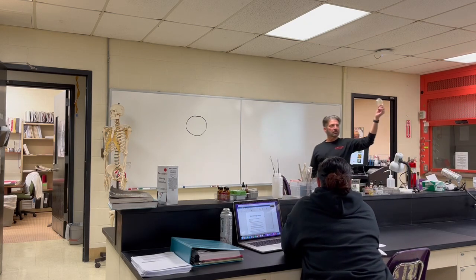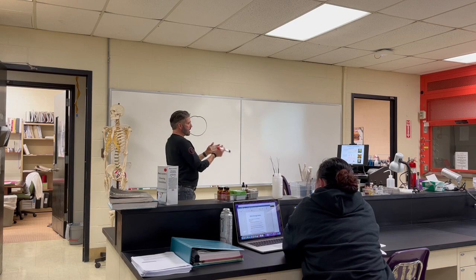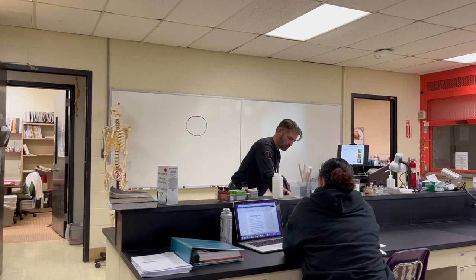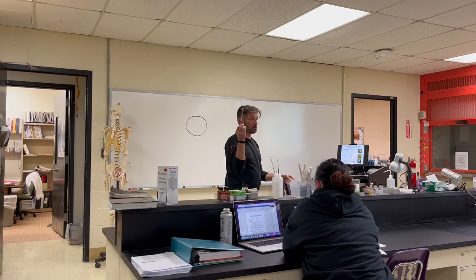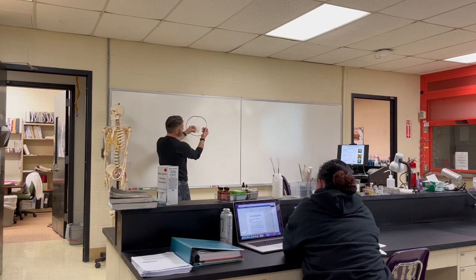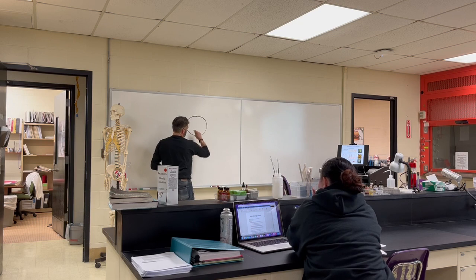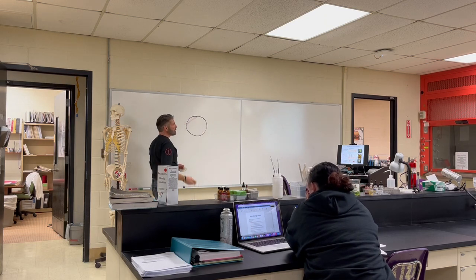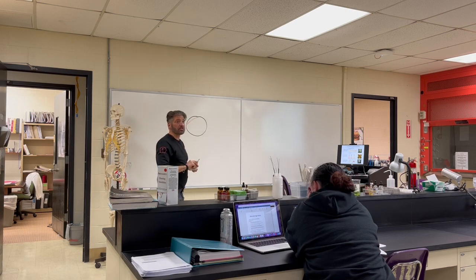So in theory, here's the plate. I'm going to take the cover off. It's sterile. Well, now it's not. But I'm going to take something out here and swab it. Let's just say I swab it like this. So I just swabbed that plate. How many bacteria do you think I just put on there? Tens of thousands. 10,000, that sounds good.